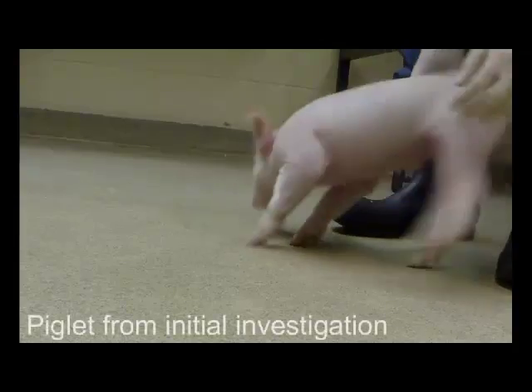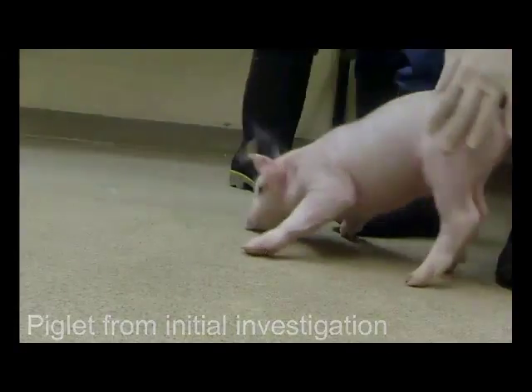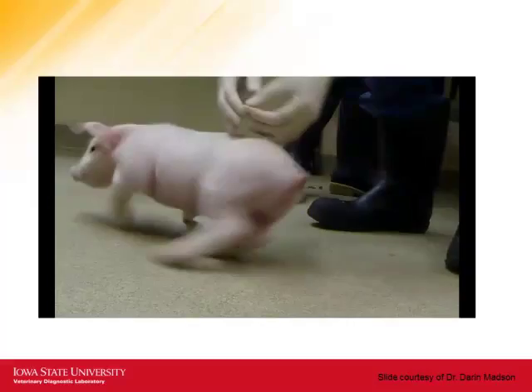So this is the first case that Dr. Arruda got. So this was a real shaker, no doubt about that. What was new about this is that he tried to isolate the virus. So he basically used this technology that I mentioned when we were talking about PRRS, next generation sequencing. So we have this fantastic tool that allows us to detect pretty much everything that is in the sample. So he was able to detect this new pestivirus.